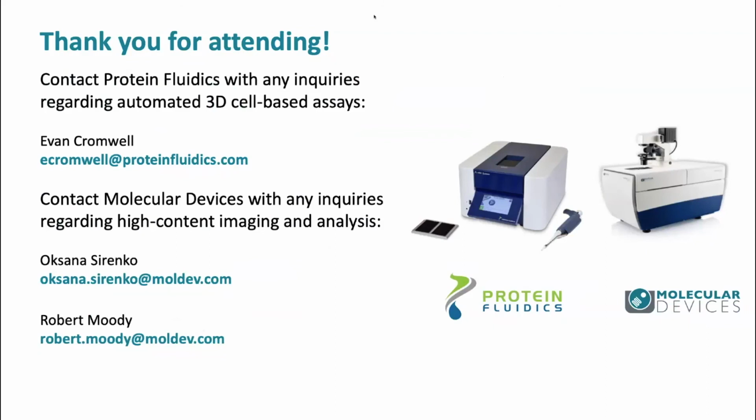Well done, thank you. We got a question from Brandon: what is the diameter of the fluidics channels? The fluidics channels are on the order of 50 to 100 microns in size. The bottom aperture of the sample is 1.2 millimeters, and so you have a good clear view of your organoid in that. Great.